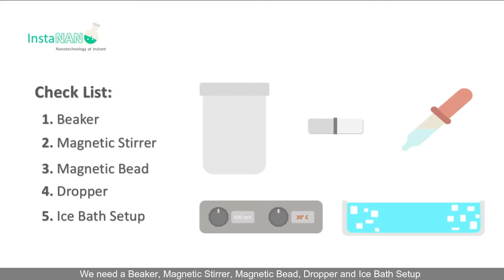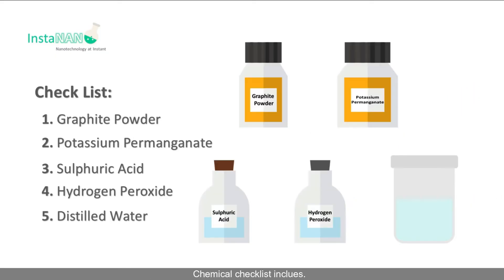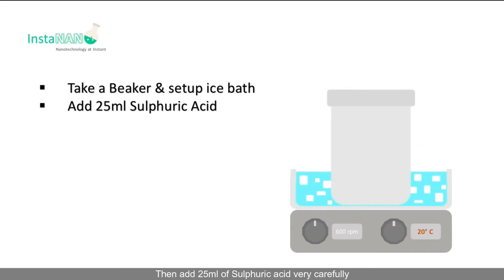Here is the apparatus and chemical checklist. We need a beaker, magnetic stirrer, magnetic bead, dropper, and ice bath setup. The chemicals include graphite powder, potassium permanganate, sulfuric acid, hydrogen peroxide, and distilled water.